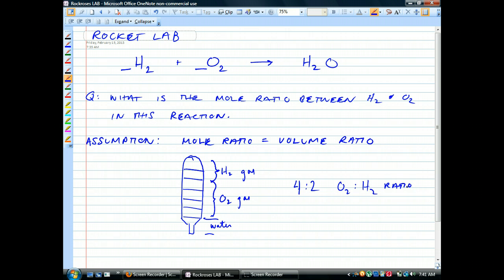What you do for collecting the gases is you're going to have a beaker, 250 milliliter beaker, and you put the bulb all the way under the water, and you just squeeze all the air out of it until it's totally filled with water. So now the bulb is totally filled with water. And then we have these two things. Now, one point of confusion is that on the handout, it says you're going to make your own gas generators. You're not. I'm going to have 4 stations set up with these white trays. This one is dissolving zinc and hydrochloric acid, making hydrogen gas. This one's making oxygen from hydrogen peroxide and manganese dioxide catalyst.